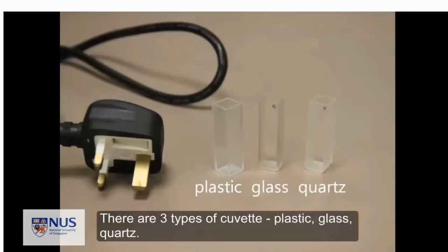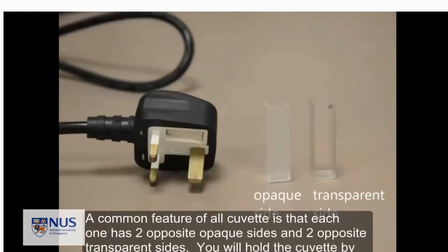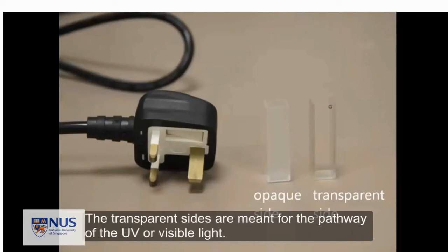There are 3 types of cuvette, one made of plastic, glass, and quartz. A common feature of all cuvettes is that each one has 2 opposite opaque sides and 2 opposite transparent sides. You will hold the cuvette by the 2 opaque sides. The transparent sides are meant for the pathway of the UV or visible light.